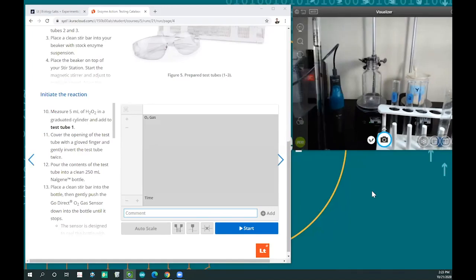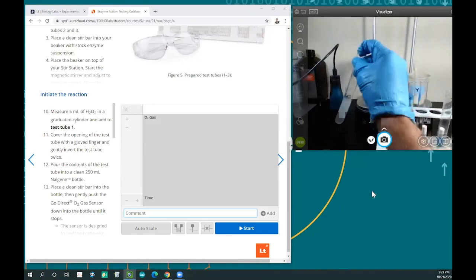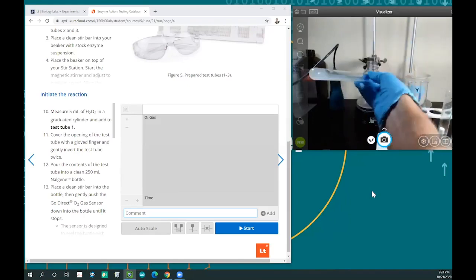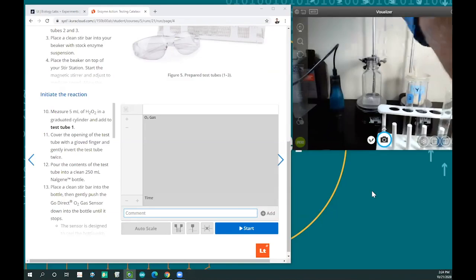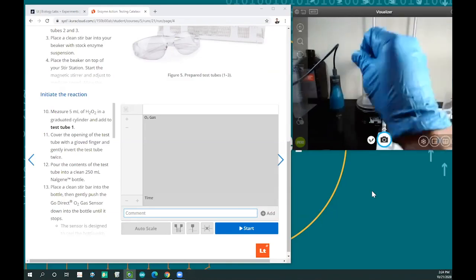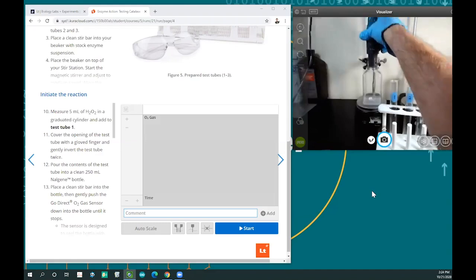There we go. Invert it a few times. Put this in place.